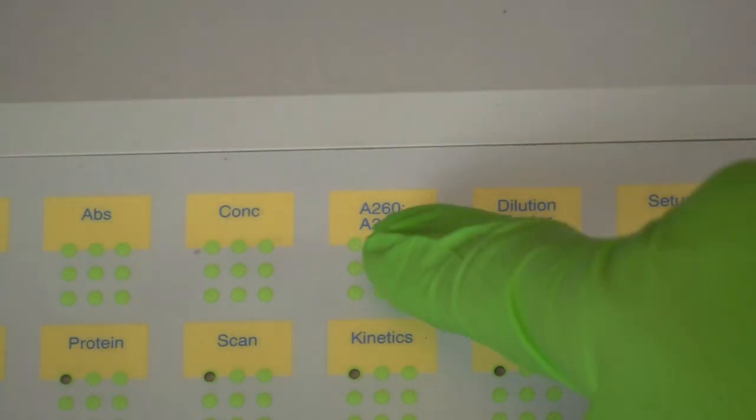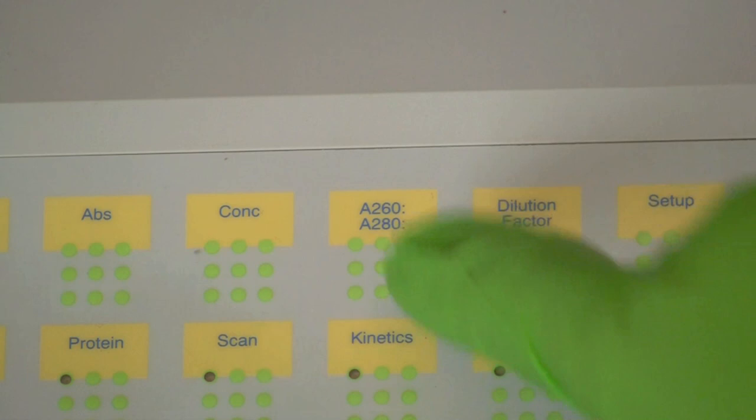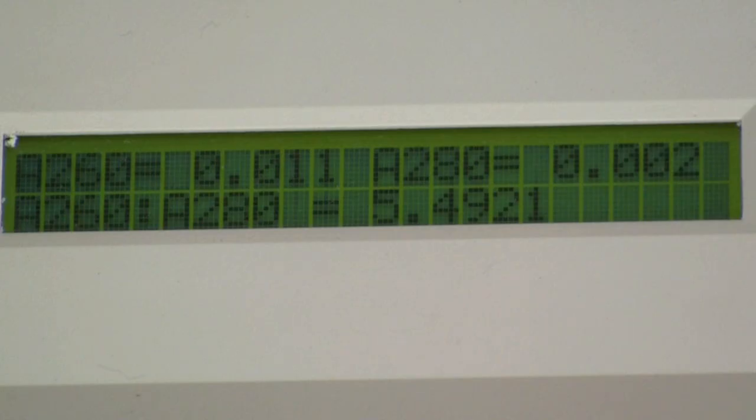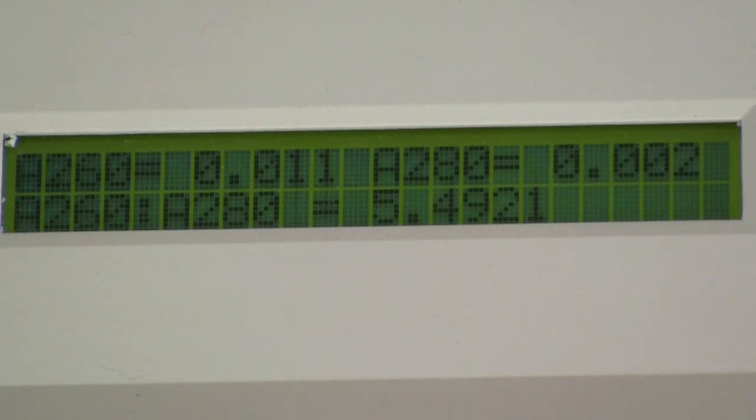To get the purity, press the 260 to 280 ratio. The result here is 5.4921.